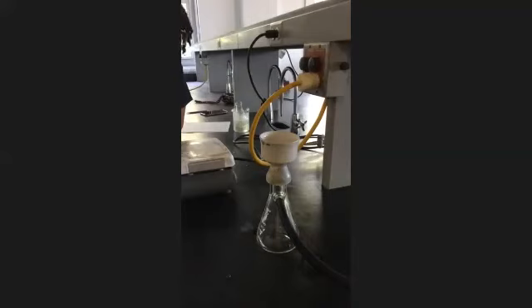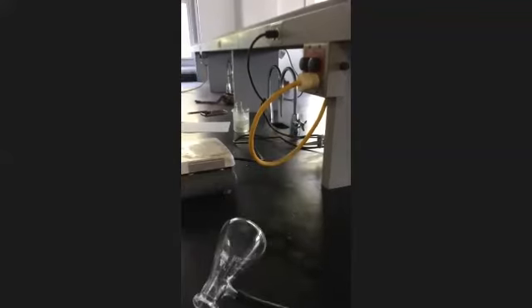So once you get that vacuum filtration set up, you see you can't just, even though the funnel is ceramic and the holes are really small, you got to put some filter paper in there. But for us, a lot of times what I'll use is a coffee filter because it's porous enough to let the liquid go through it, but it's tight enough so that your solid can't go through.